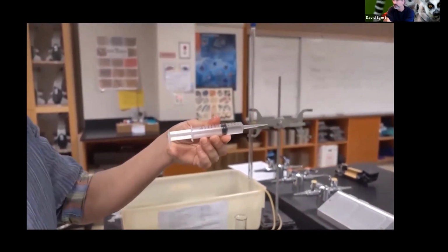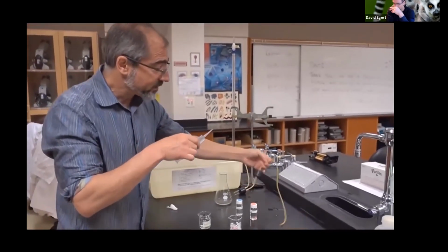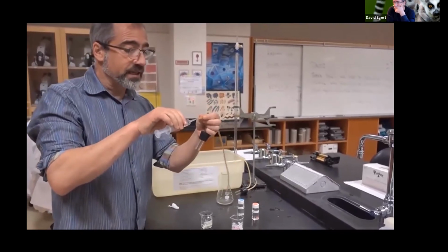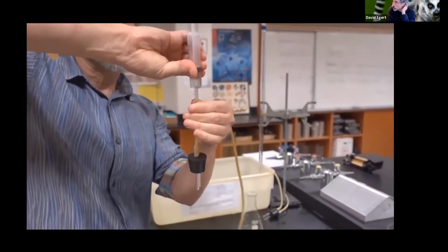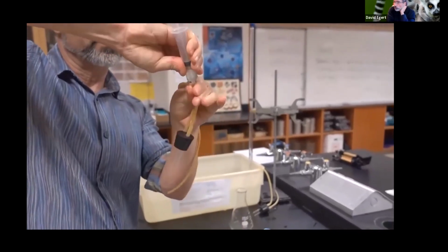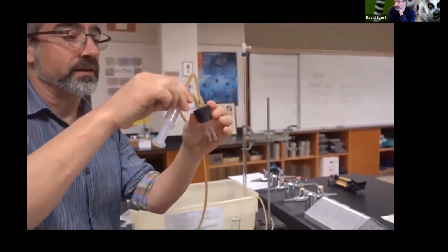So that's my dilution for trial 2. This then gets very firmly attached onto the short tube of this little setup going into the stopper. You really want to make sure that this is sealed well and isn't going to fall off when you're going through the experiment.